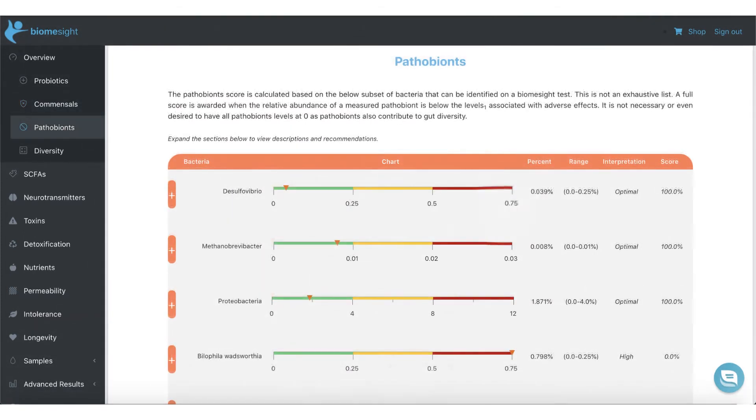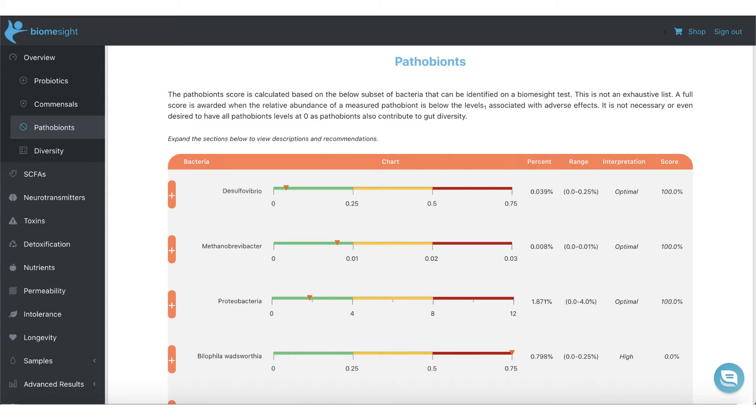The pathobiont section contains bacteria that should only be present in smaller quantities. Once again, you can see recommendations on how to reduce these, as well as compare your values to the ideal and BiomeSight distribution.